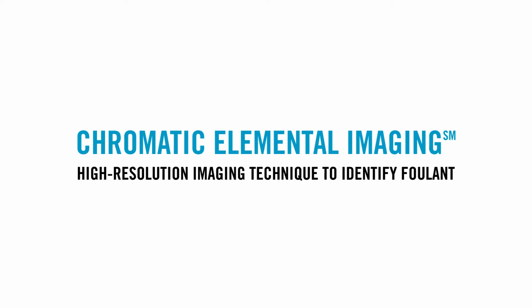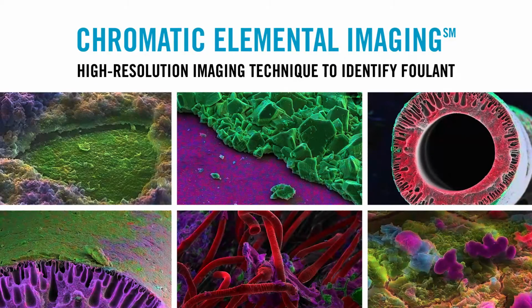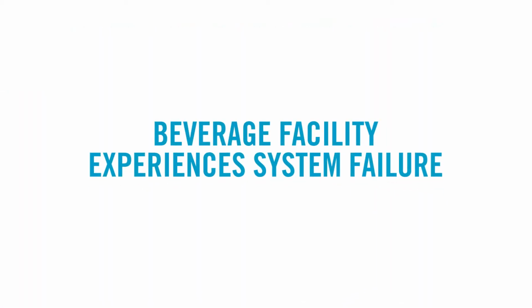Chromatic Elemental Imaging, or CEI, is a high-resolution imaging technique used to identify foulant in vivid color. To illustrate this technology, we will review a case study where CEI was crucial in fully understanding and troubleshooting a complex situation at a beverage facility in system failure.